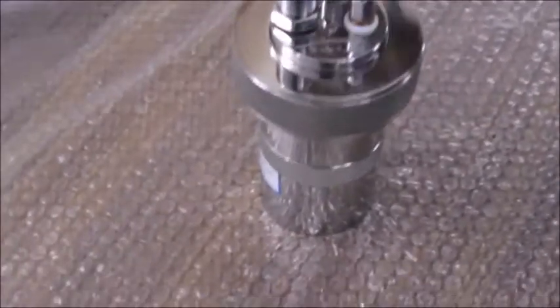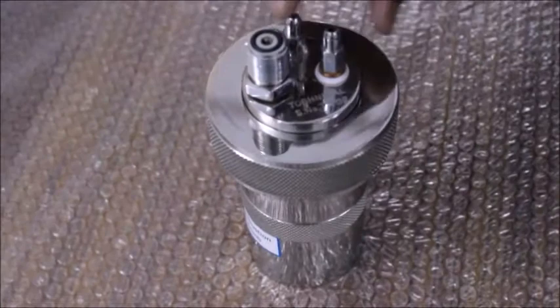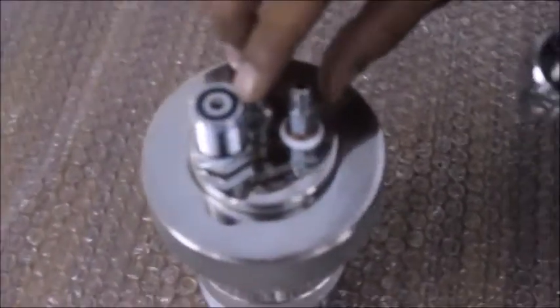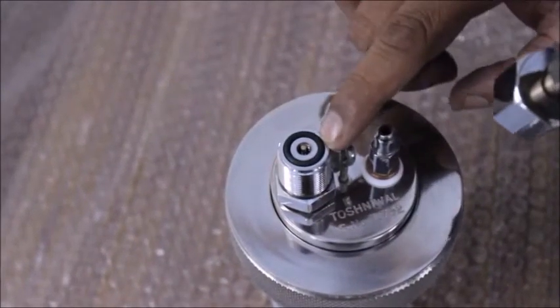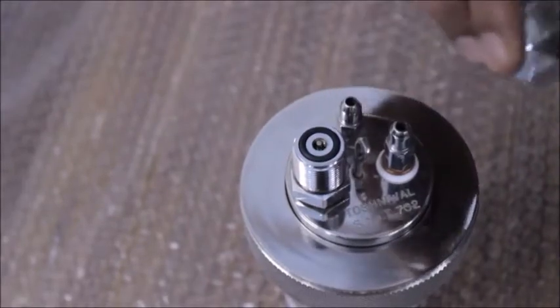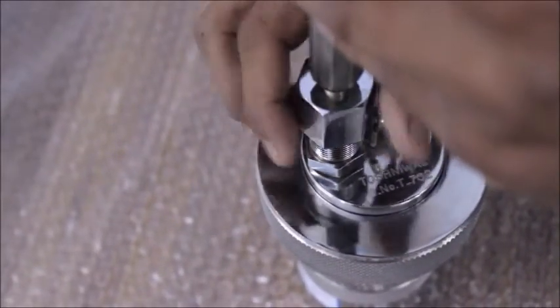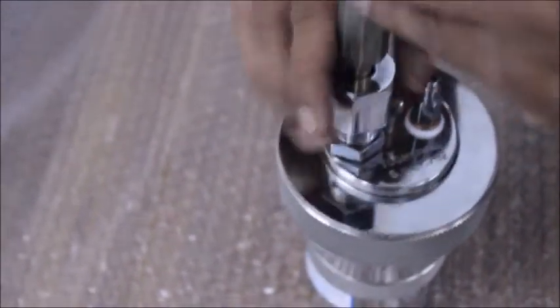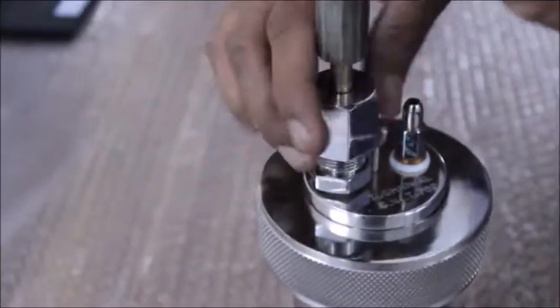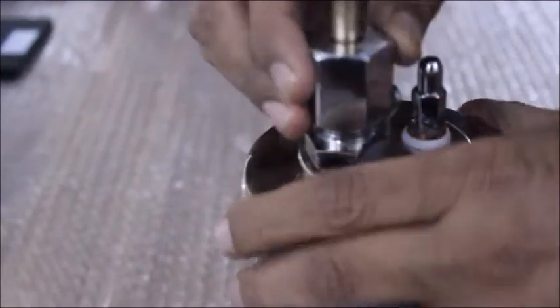This is the assembled combustion bomb. We will now connect the oxygen gas pipe to the non-release valve. Make sure that the connection is hand tight.